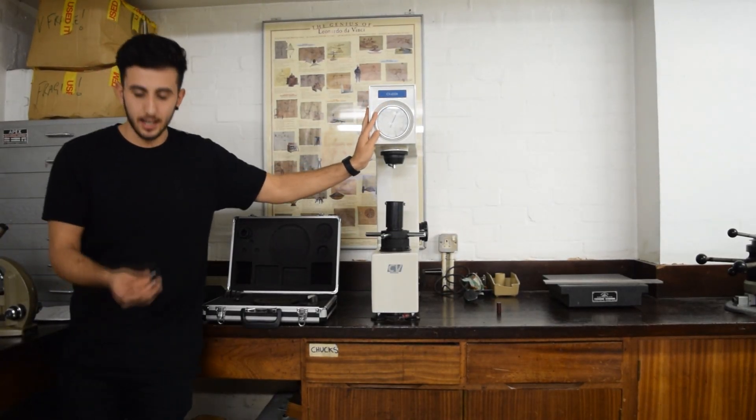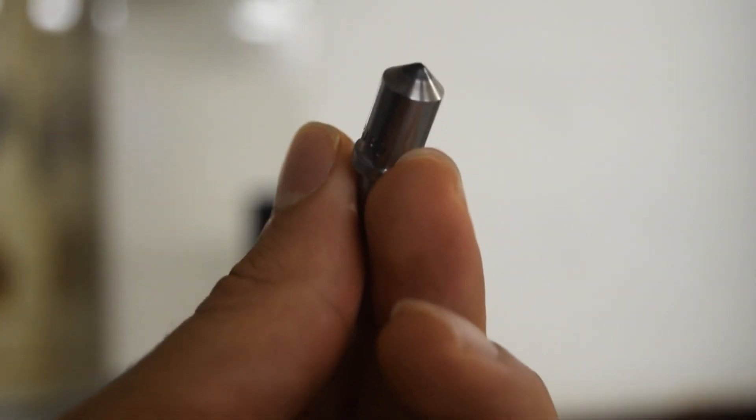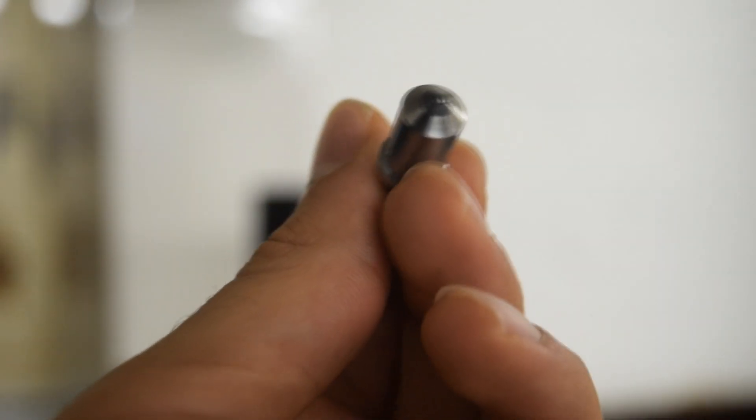Scale C uses a diamond indenter like this one. It measures materials like quenched steel, tempered steel — more of the harder materials.